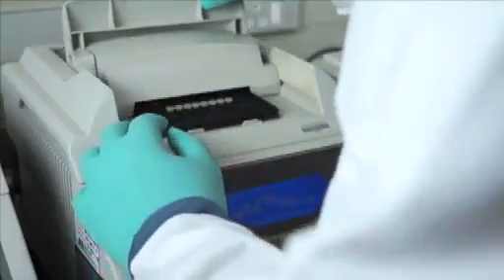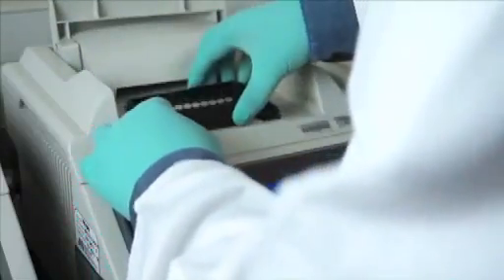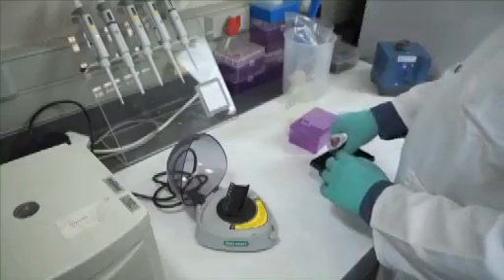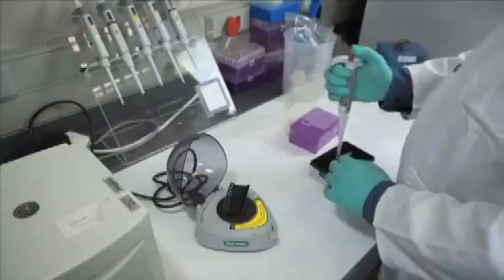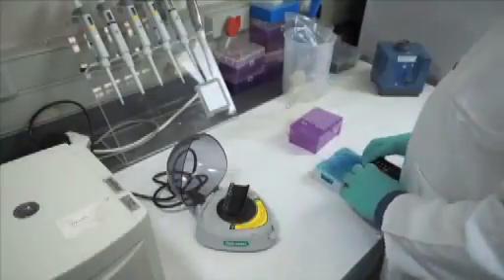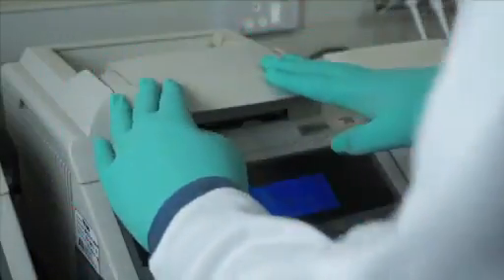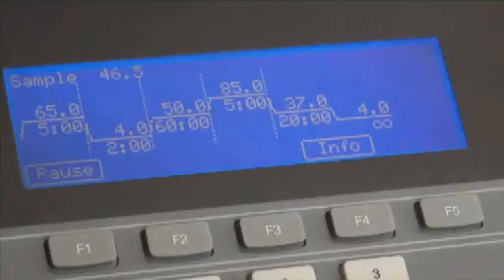Pause the thermocycler while still at 4 degrees Celsius. Take out the tubes and add 5 microliters of the enzyme mix while keeping the tubes on a cold block. Mix gently followed by briefly centrifuging and return to the thermocycler. Hold the tubes at 50 degrees Celsius for 60 minutes followed by 85 degrees Celsius for 5 minutes. Cool to 37 degrees Celsius and pause as soon as it reaches this temperature.